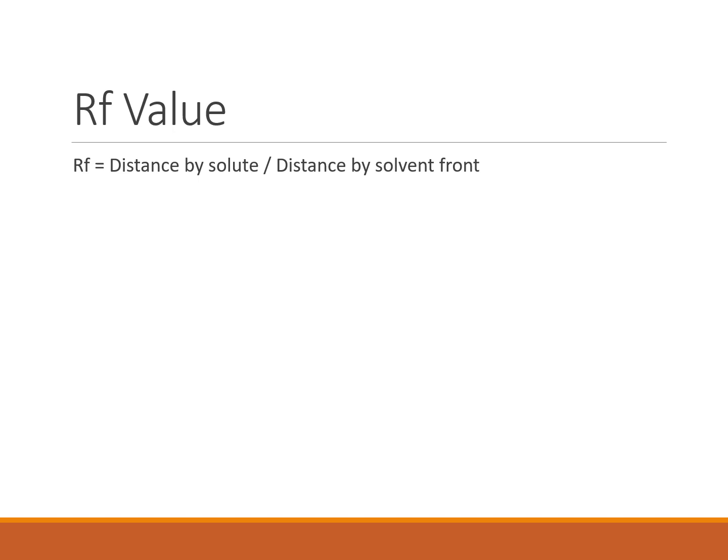Then the solute mixture, the sample mixture, is also marked. So each component will move a different distance.